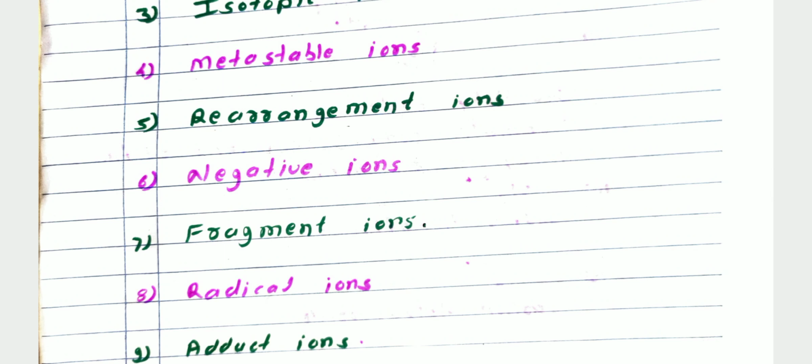Then one more ion is the fragment ion. Fragment ions can be cations, anions and radical cations generated by fragmentation of an excited state or inherently unstable parent ion. They contain a significant proportion of the original structure. Their formula weight is less than the molecular ion weight as they contain only a portion of the analyte. The uncharged fragment, that is a radical or small molecule, cannot be called a fragment ion. Fragment ions of methane and toluene we will study further.